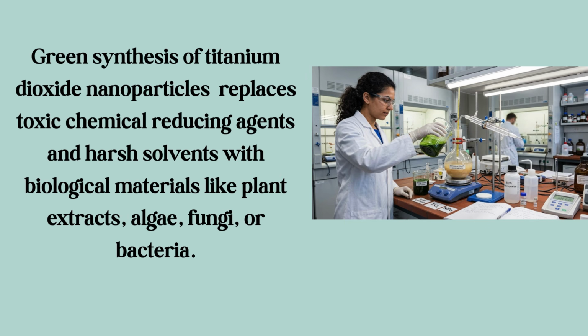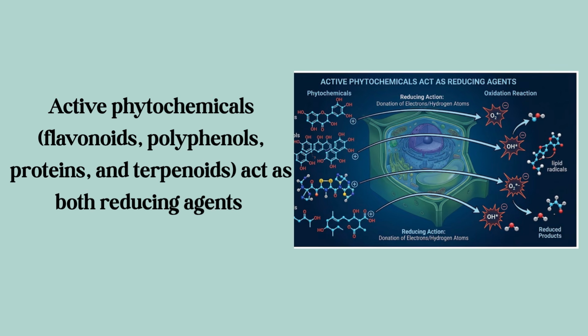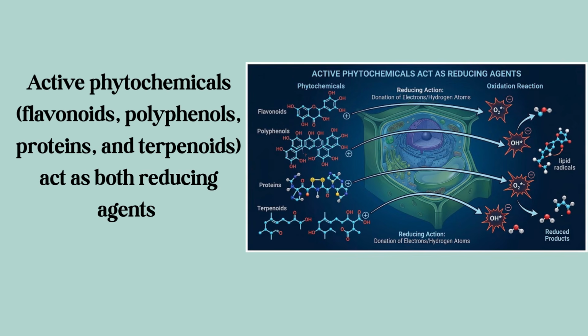Green synthesis of titanium dioxide nanoparticles replaces toxic chemical reducing agents and harsh solvents with biological materials like plant extracts, algae, fungi, or bacteria. Active phytochemicals, flavonoids, polyphenols, proteins, and terpenoids act as both reducing agents, converting precursor ions to nanoparticles, and capping, stabilizing agents preventing nanoparticle agglomeration.